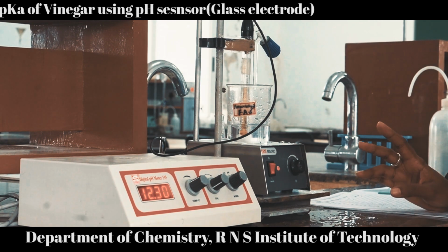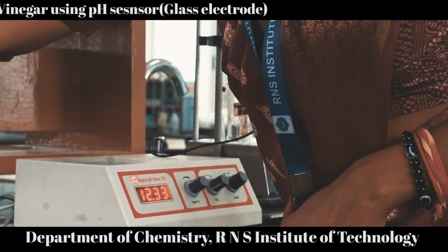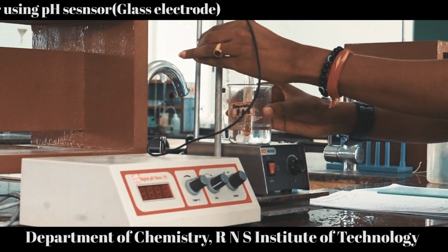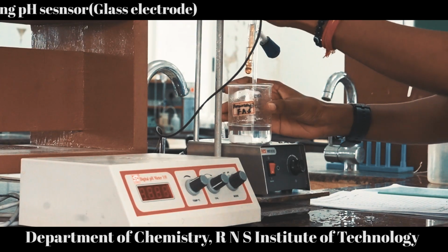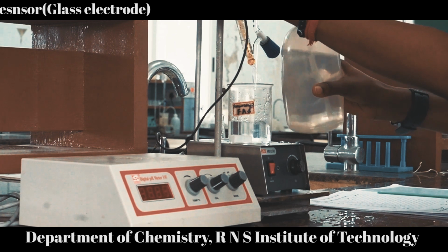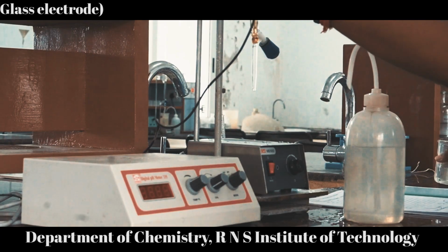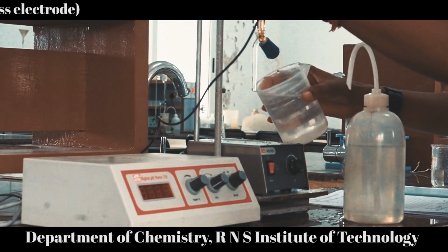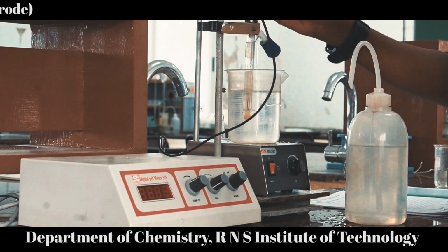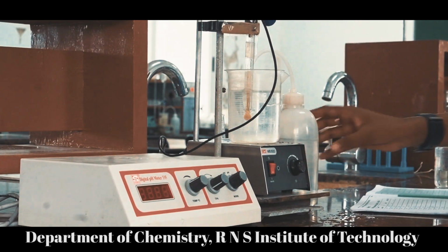So let us switch off the instruments. Remove this electrode carefully and wash it into the same beaker. And then you can replace it with the beaker which was used earlier, like this. So this completes our experiment.